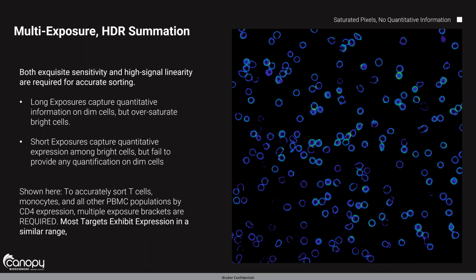So the illustration on the right here is thus. What I've done is I've used my microscope to collect an image that gives me pretty nice contrast, so I can nicely see those cell borders. In order to do this, I've used a camera exposure of about, say, 100 milliseconds. So, nice looking picture. But what happens if I increase that to 200 milliseconds of exposure?